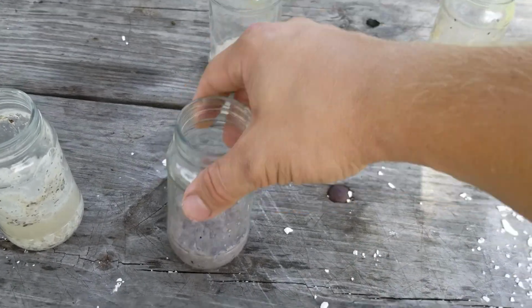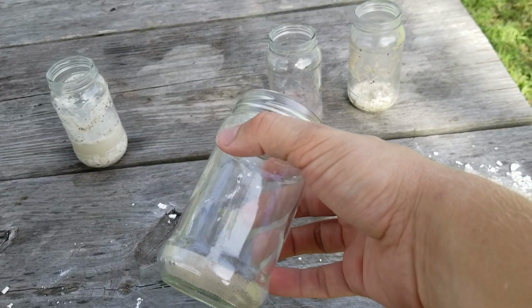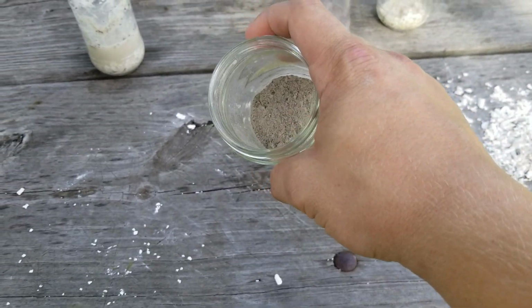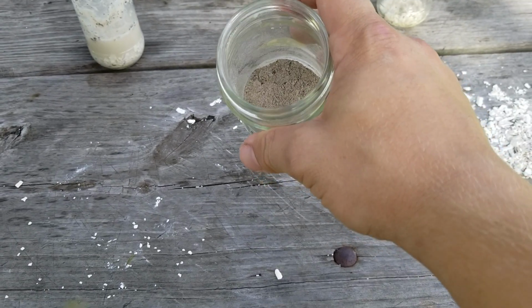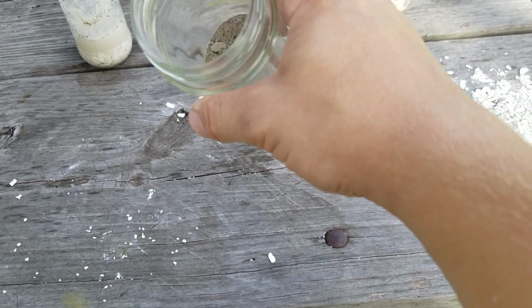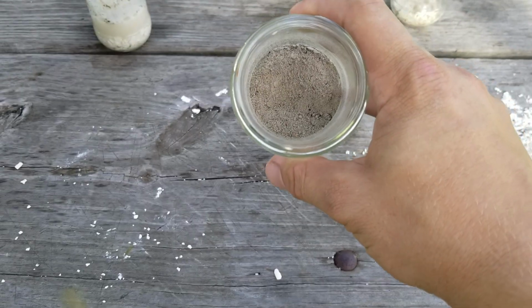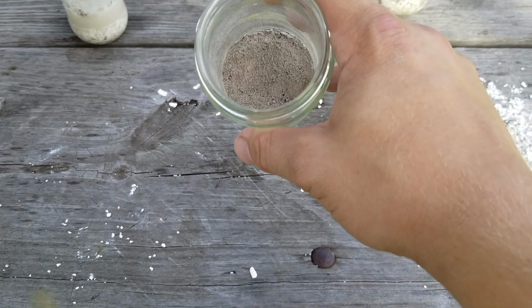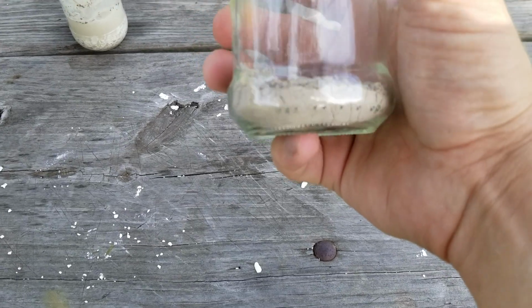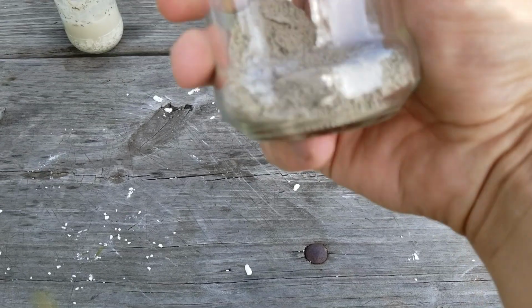And one of my favorite examples here is taking this. This is wood ash. Wood ash is a byproduct of combustion, obviously, and it consists of various carbonates and some halides. You get a little bit of calcium chloride, potassium chloride, sodium chloride, don't really care about that. But the important thing is it has a bunch of carbonates in it. Calcium carbonate, potassium carbonate, and sodium carbonate. The quantities of each depend on the type of wood you burned and the environment it came from.